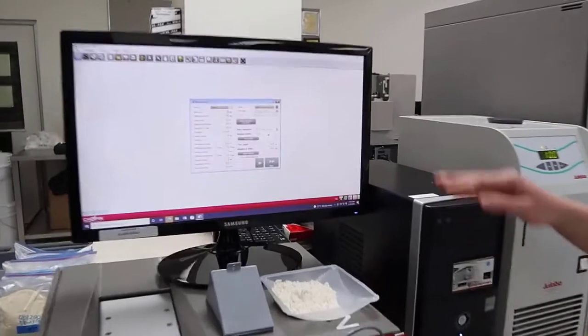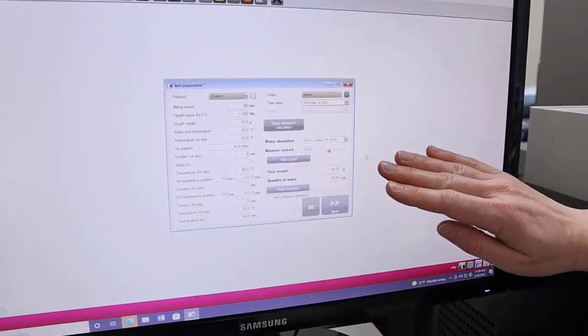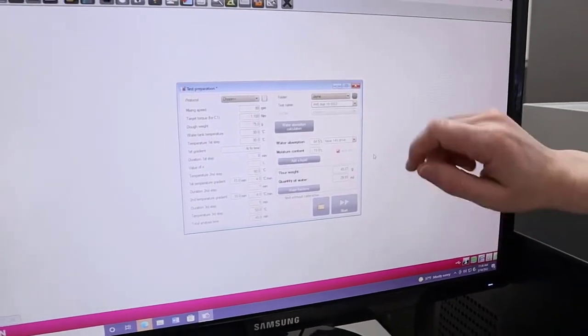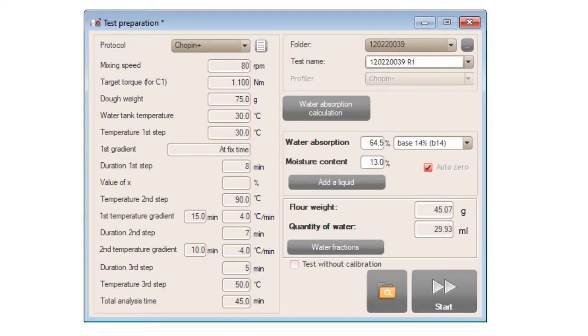So what I've done is I've input all the flour information into the dialog box here. Some of the key things, in addition to just naming your test, you can set the moisture basis for your flour. I've entered my moisture content and my target water absorption, and so the dialog box automatically calculates the amount of flour that I need to weigh out, which I've already done, and then this is the amount of water that the instrument will automatically add while I'm running the test.